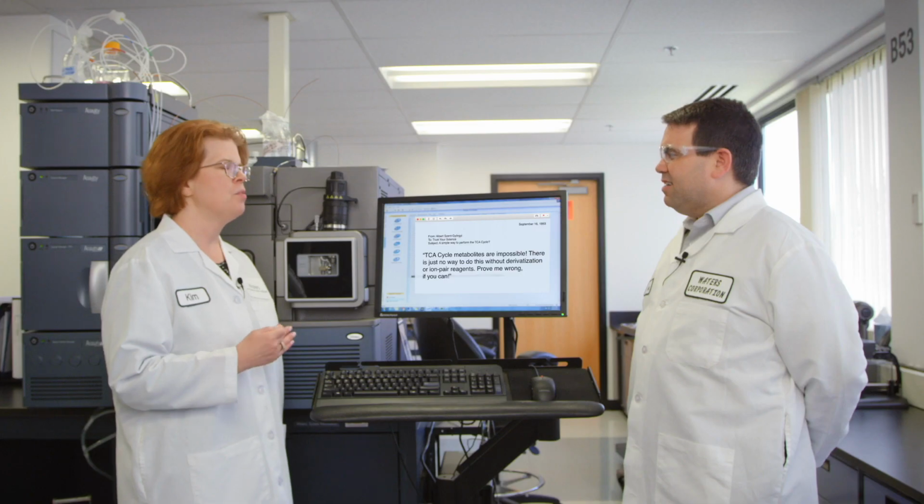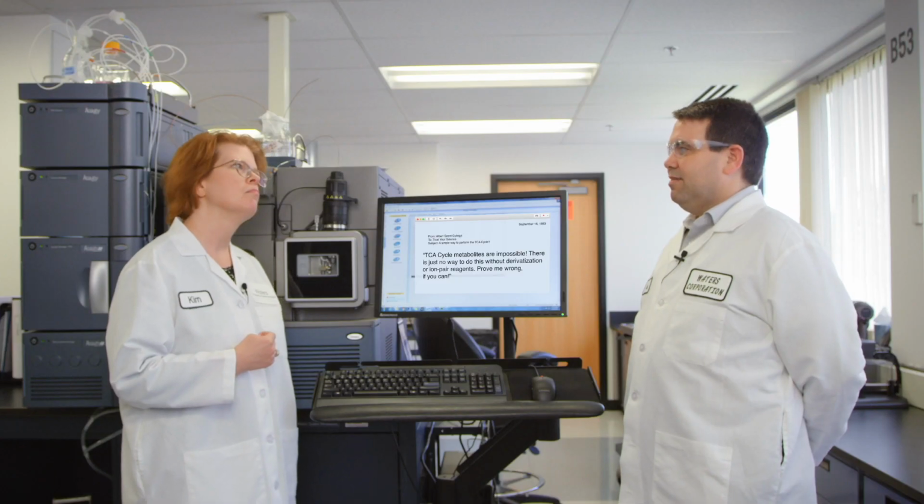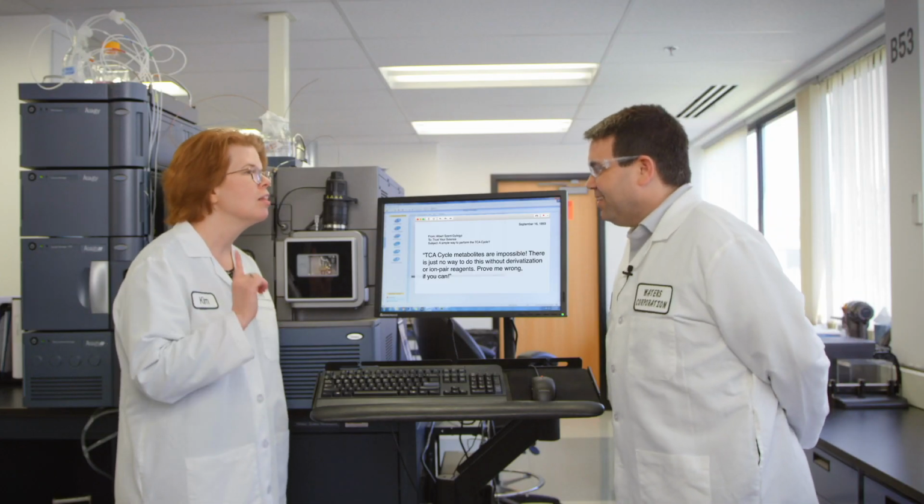I think we do, because the only methods I've seen, there's no really simple way to do this. You have to do derivatization. You have to use complicated mobile phases. I think we're out of our league. I think we need the special apps team. I do too. Who do you think would be perfect for this one? Carrie. Let's go find her.